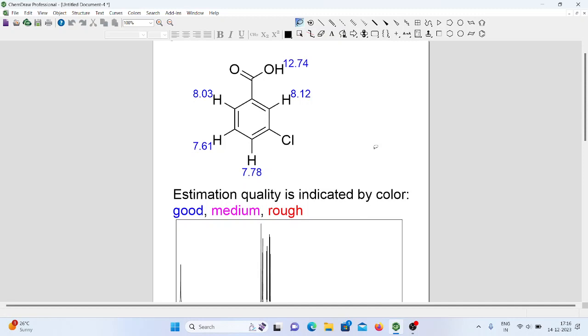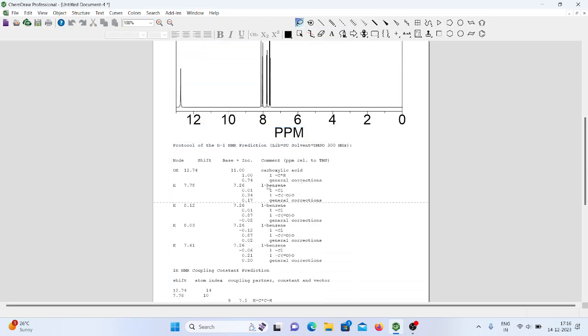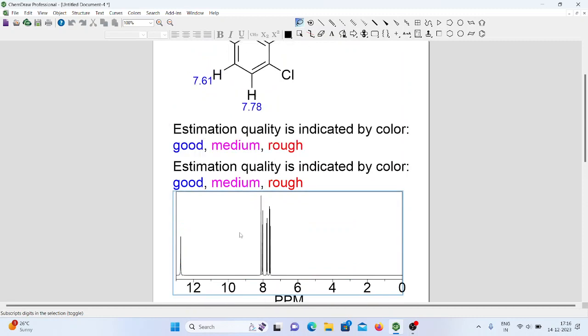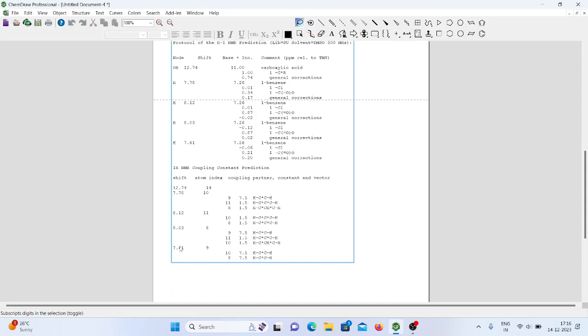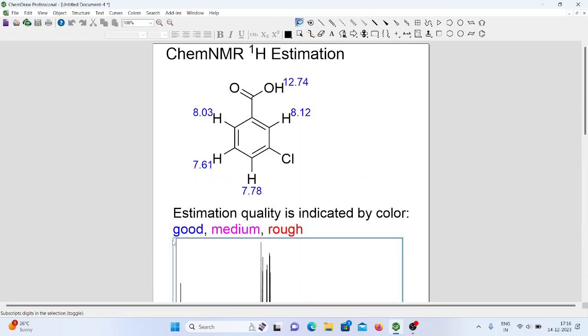So in this way, the theoretical spectral data helps in the interpretation of the compound structure. Okay. So in this way you will get the data. Here, see, for your understanding, all kinds of protons are mentioned here. Suppose if you are not identifying from here, you can identify. So in this way you can get the proton NMR data of certain chemical compounds.